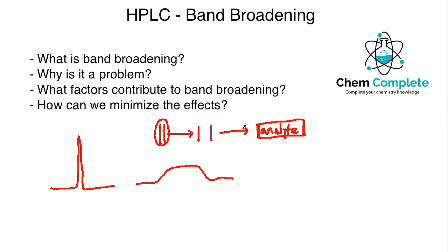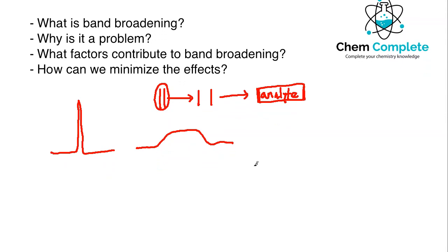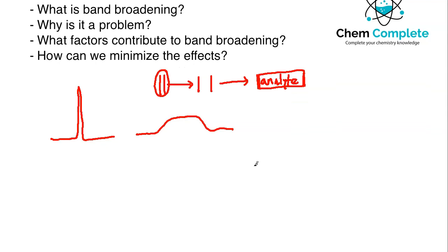So what is really the issue outside of the fact that the peaks occasionally may run together? What is the problem here? Okay, well, number one, when you're using HPLC to purify a mixture of components, these analytes will often come out mixed together.